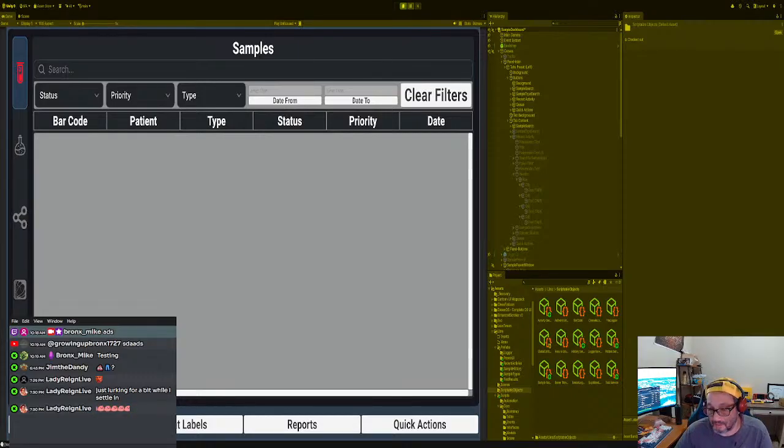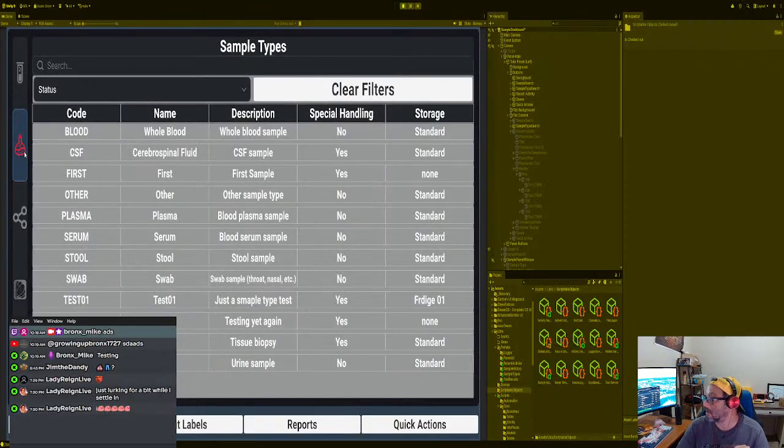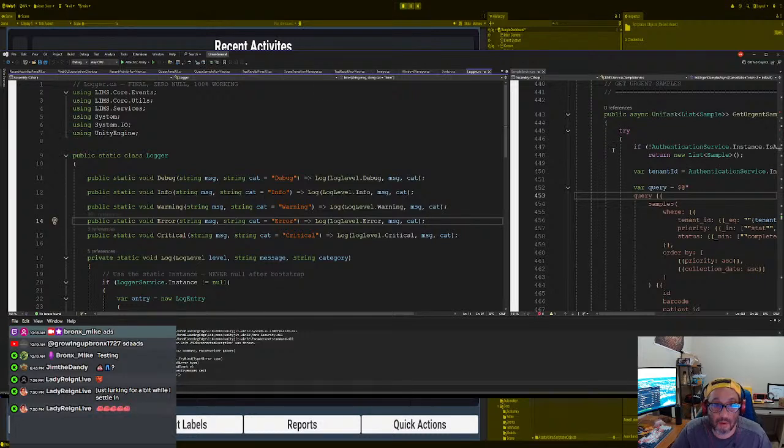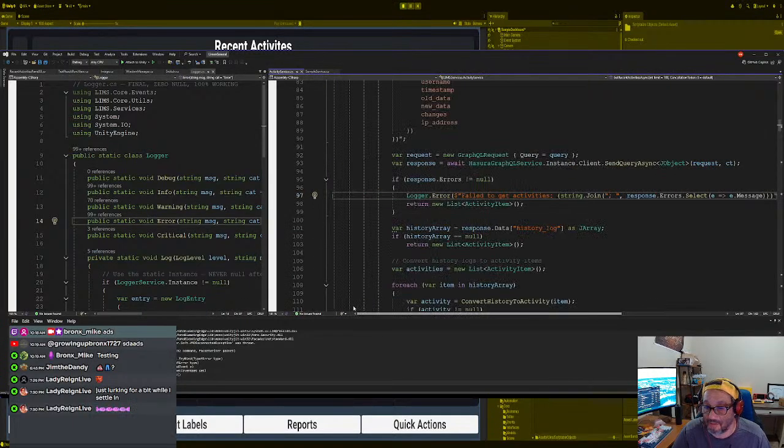Remember, software engineering is kind of boring. We have to test over and over again, and stuff like this is just preliminary. We haven't even done real testing yet. Let me see. Make sure there's no errors. Okay, and we have history log timestamp. Oh, okay. So a timestamp. You have an error here. So we're not crashing anymore. Thank God. Because we didn't have a history set.